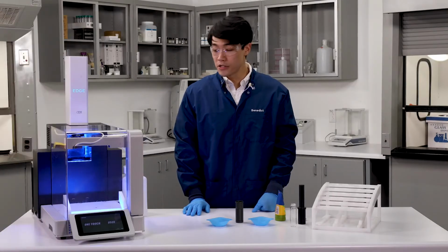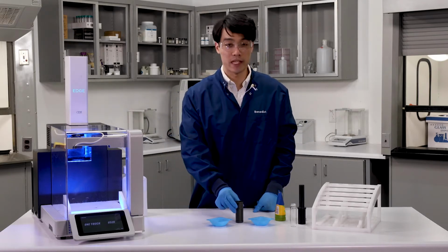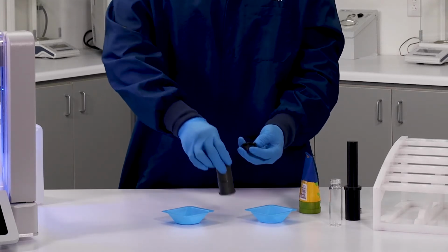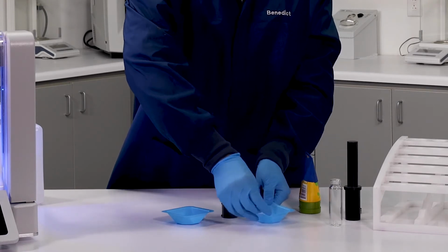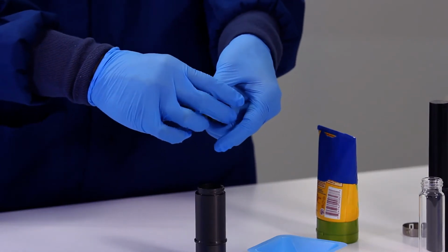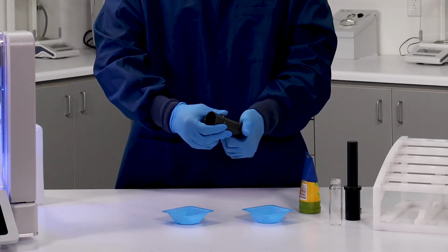All right, Edge, let's go ahead and begin on our sample preparation process for this extraction. So first thing we're going to do is take our sample cell, the Q cup. We'll go ahead and disassemble. And into the base, we'll add our Q disc, which is our inline filtration system for the Edge. We'll insert it into the bottom, making sure it's laying nice and flat. And then we'll assemble the two pieces by screwing together.